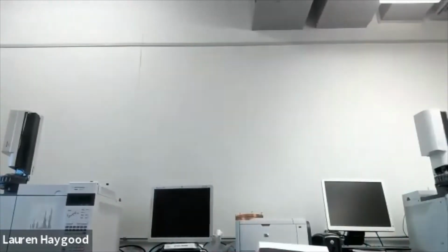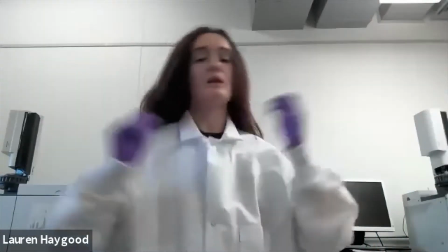We're gonna do some fun chemistry with foam cups, acetone, and water. So I'm gonna put on gloves and put on all my lab safety gear. Gloves are on. Lab coat is on. And safety goggles.